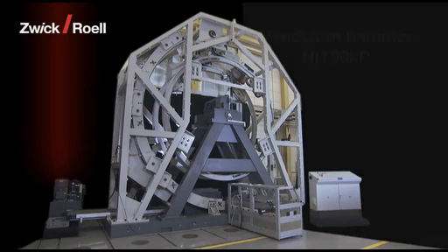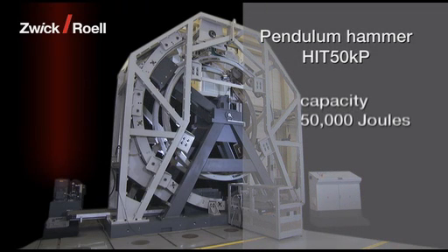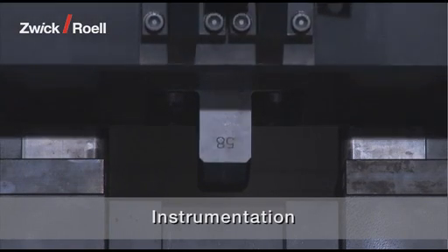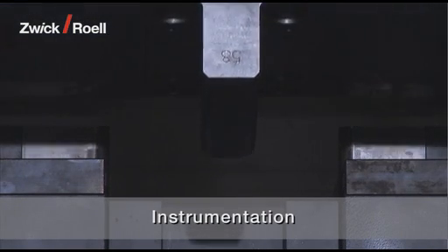The hammer for this Pendulum Impact Tester has a capacity of 50,000 Joules and weighs 1,450 kg. The Pendulum Hammer is equipped with an instrumented Tup for determining the force path on impact.